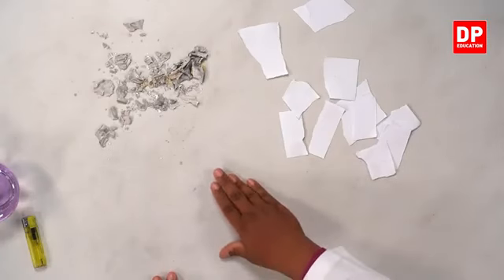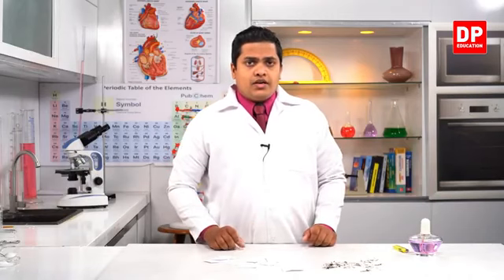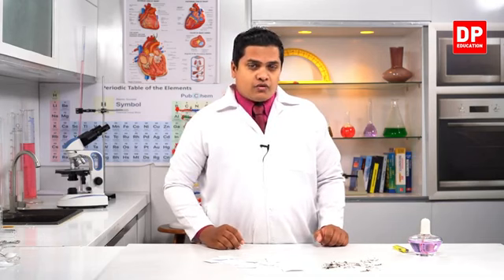In the second one, the chemical changes. So we'll observe somewhat different things rather than burning things, rather than burning the paper. We'll observe different activities, different experiments to observe what sort of a thing is a chemical change and what sort of a thing is a physical change. So let's carry out some different activities to identify those examples as well.